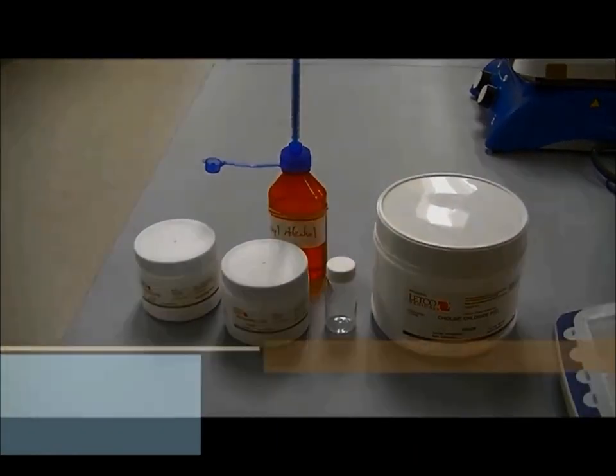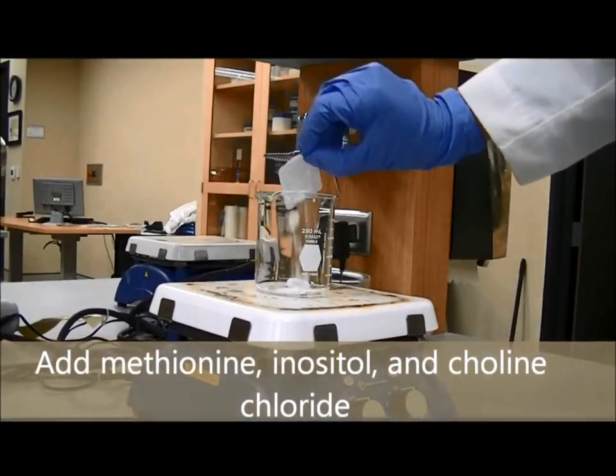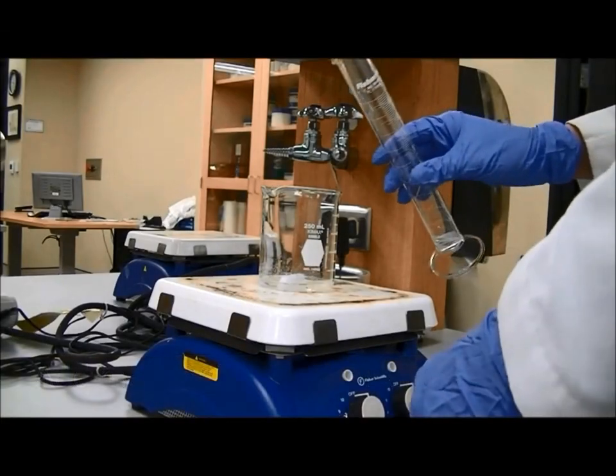Week 9, MYC Injections. Add methionine, inositol, and choline chloride.